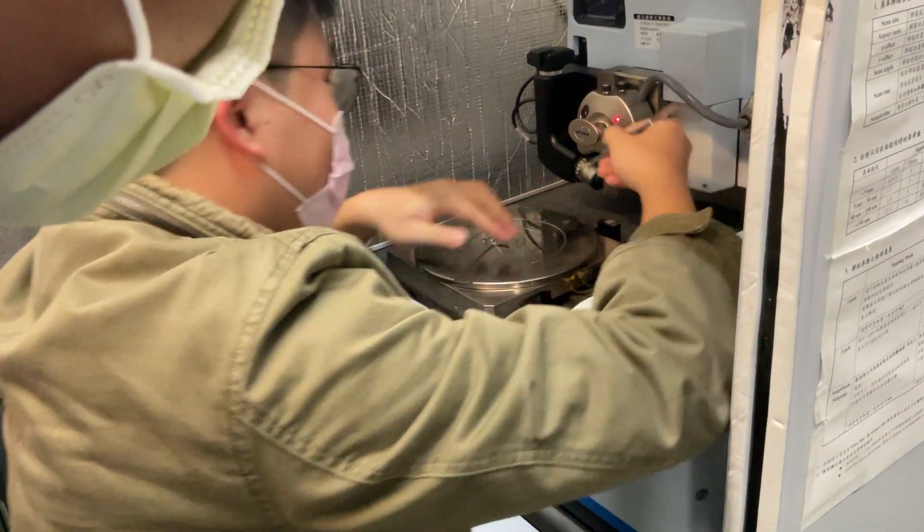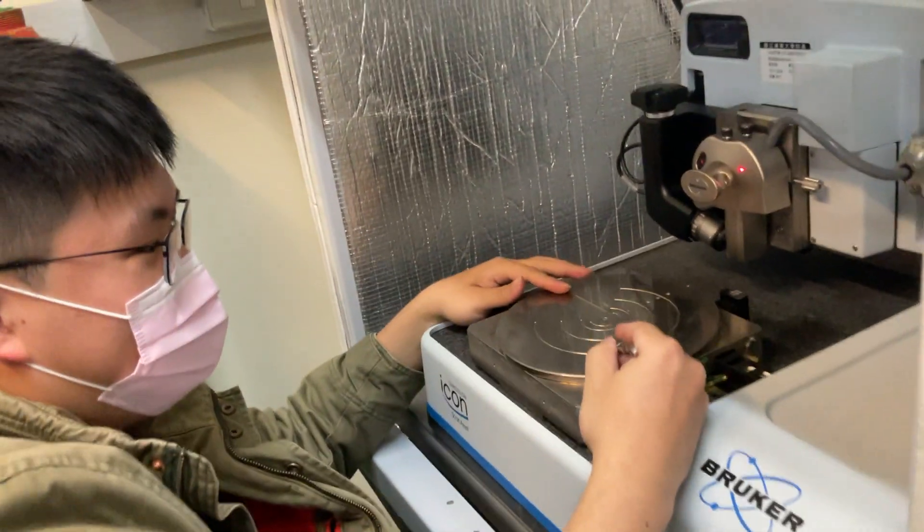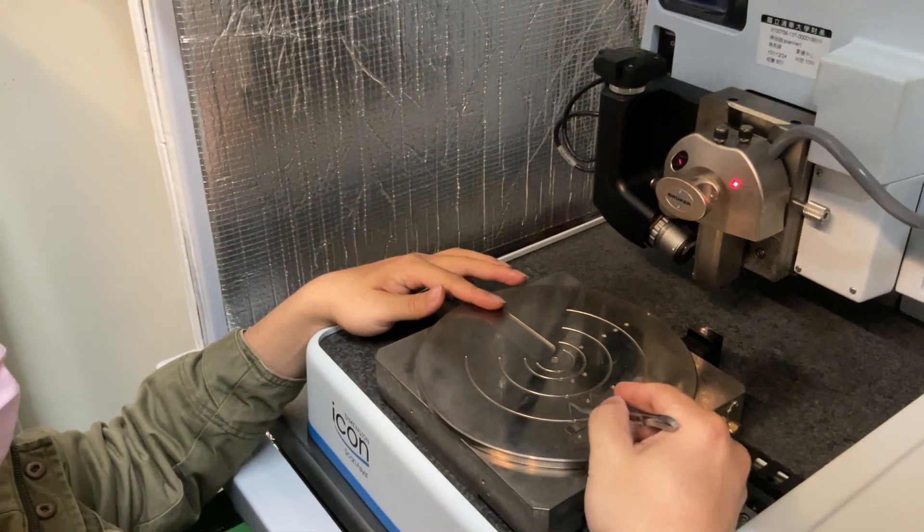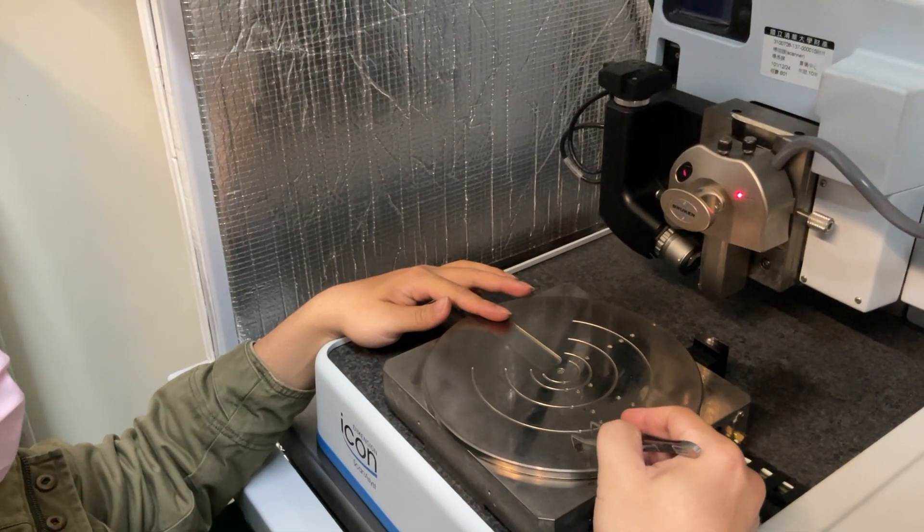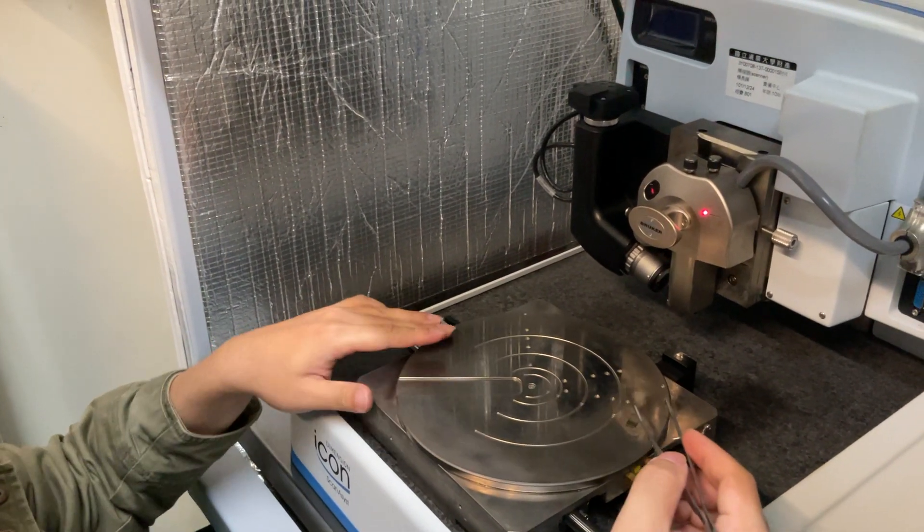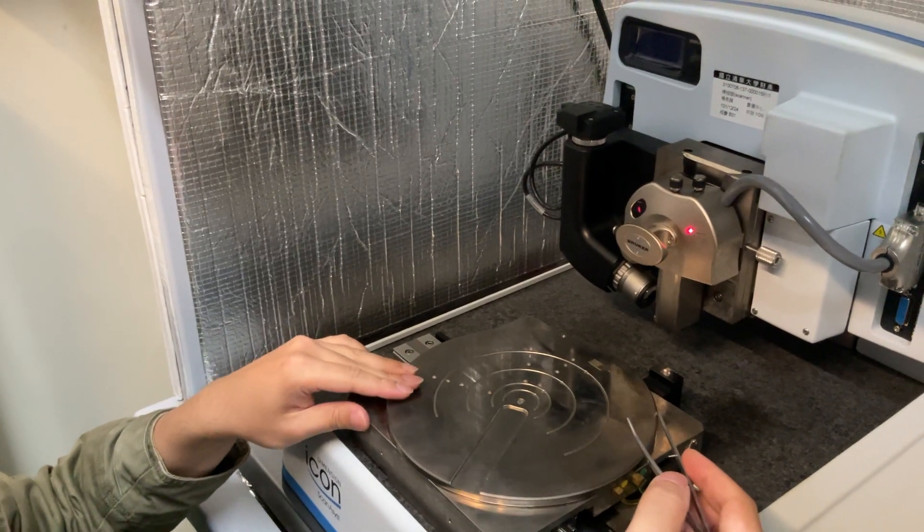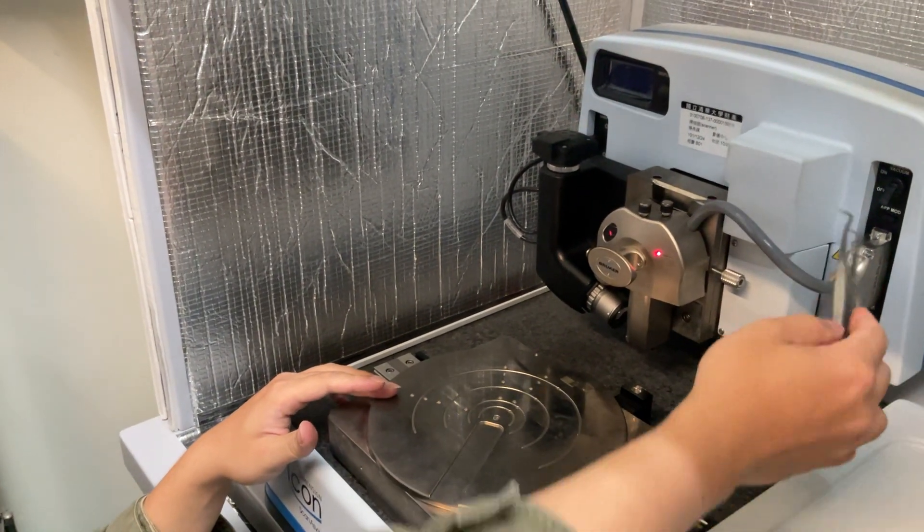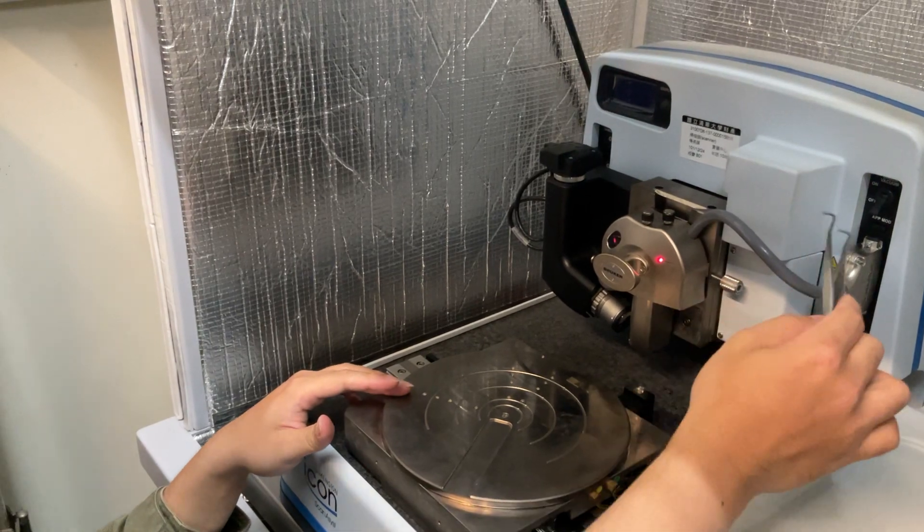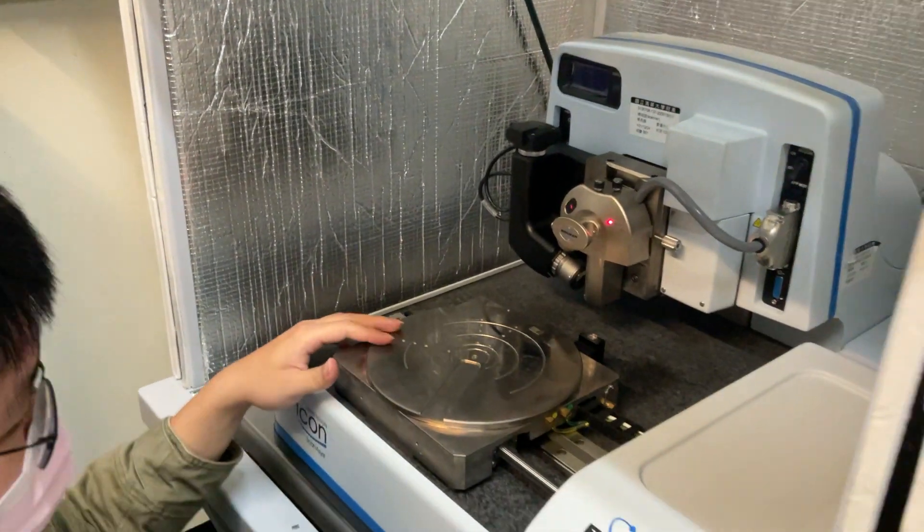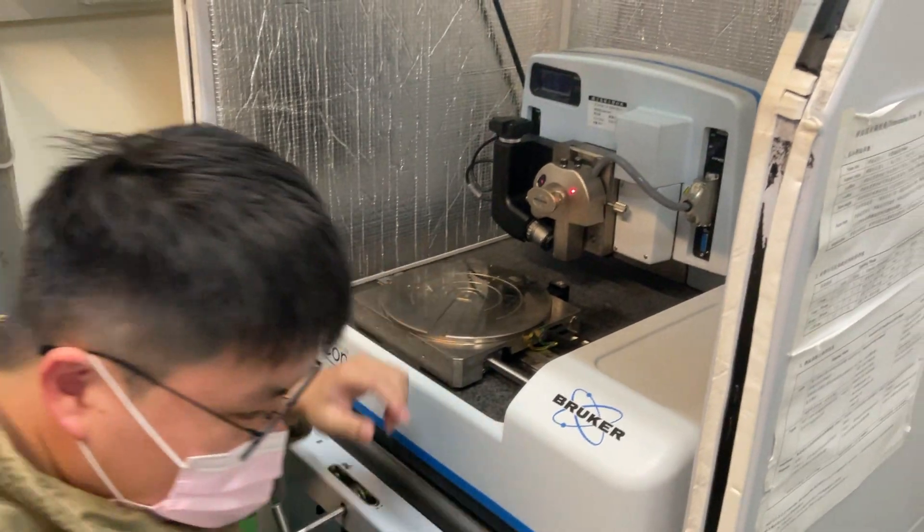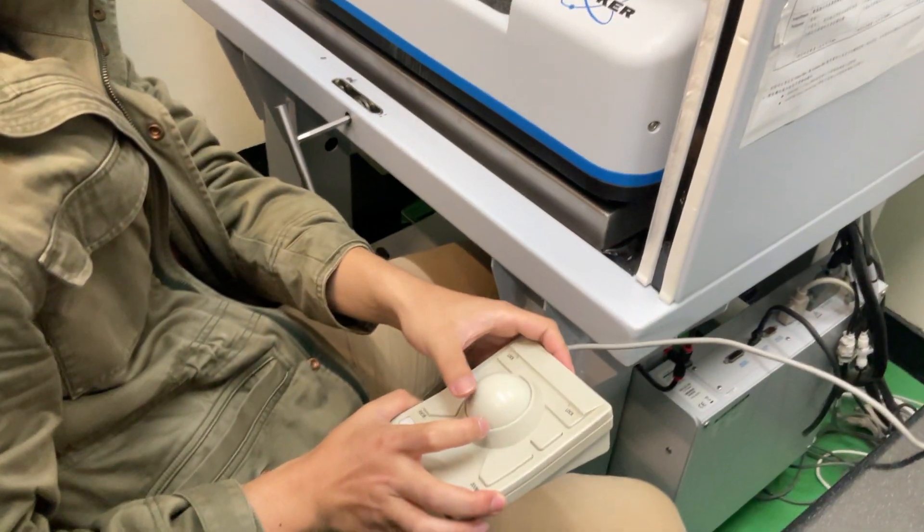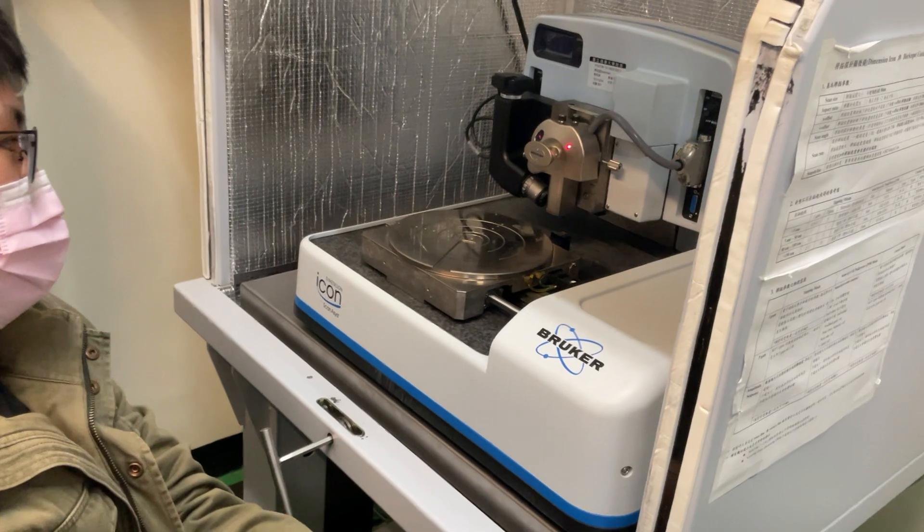And then we need to put our sample here, this one. And we need to turn on the vacuum pump, but this one now is broken, so I just cut it off. And we use this one to load our sample.